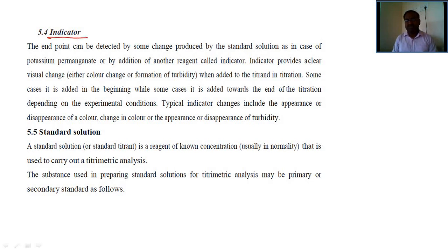Indicator. When both titrant and titrand are colorless, the determination of the end point is too difficult. That's why we add an indicator. An indicator is a chemical substance which indicates the end point of the titration.